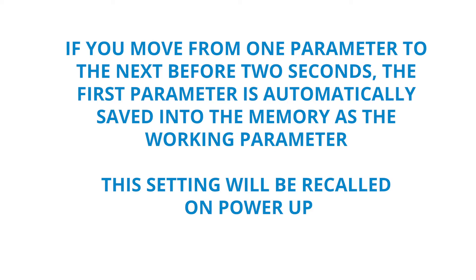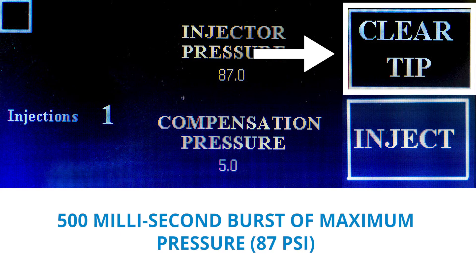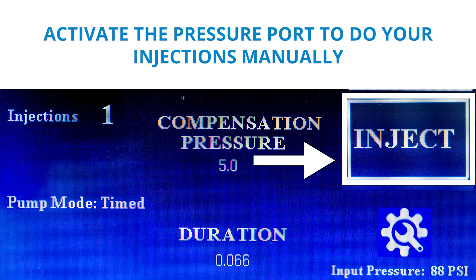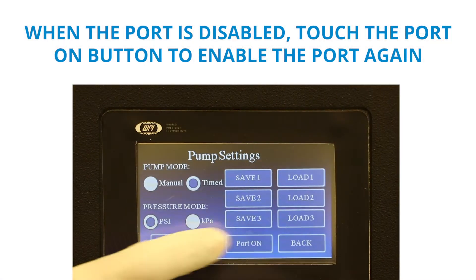The clear tip button activates a 500 millisecond burst of maximum pressure through the injection tip. This can be used if the tip becomes clogged. The inject button allows you to activate the pressure port to do your injections manually. When the port is disabled, simply touch the port on button to enable the port again.